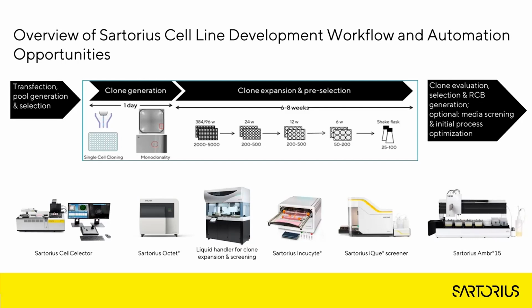The process to isolate and select individual monoclonal cells carries both the risk of making an incorrect selection and thereby discarding clones that would outperform others in the final scale, as well as the potential for poor outgrowth after the cloning step.